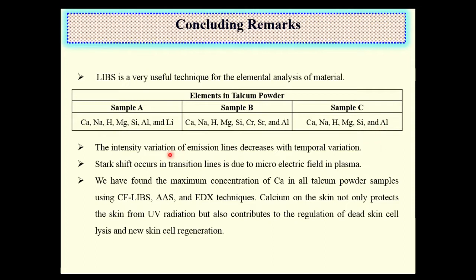Our results show the intensity variation of emission lines decreases with temporal variation, and not only temporal variation, but axial variation also. Stark shift occurs in transition lines due to the microelectric field present in the plasma. We found the maximum concentration of calcium in all talcum powder samples using calibration-free LIBS, AAS, and EDX techniques.